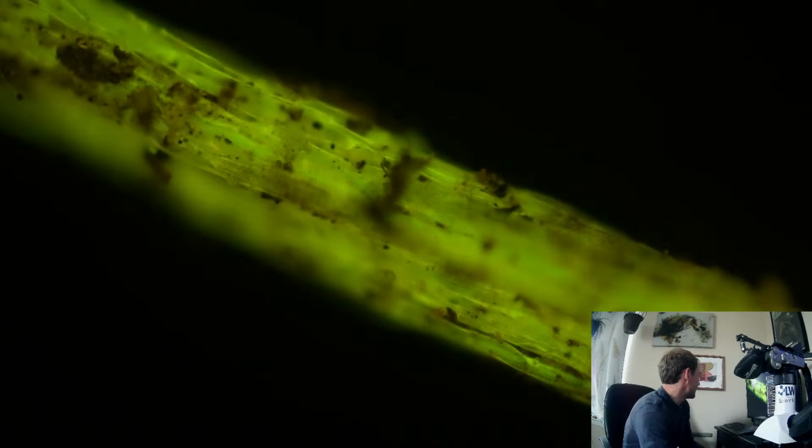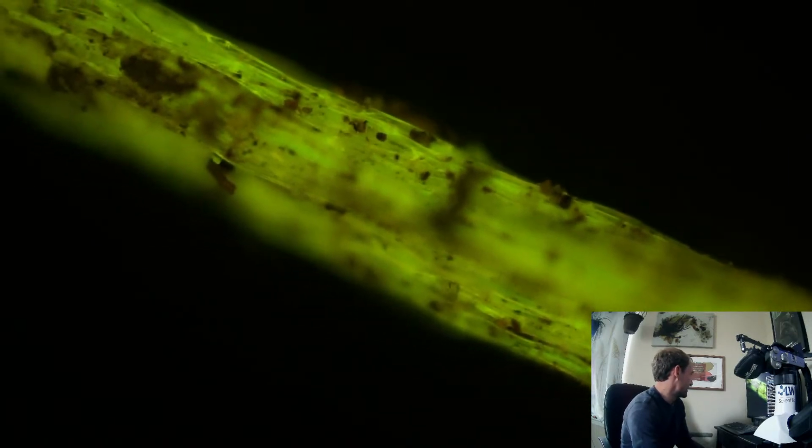And let's see. Oh yeah, I'm definitely seeing, that's a tube right there. Or a hyphae, I should say. Let's see if we can go in 400x. And I got a good focus on what I was just seeing.